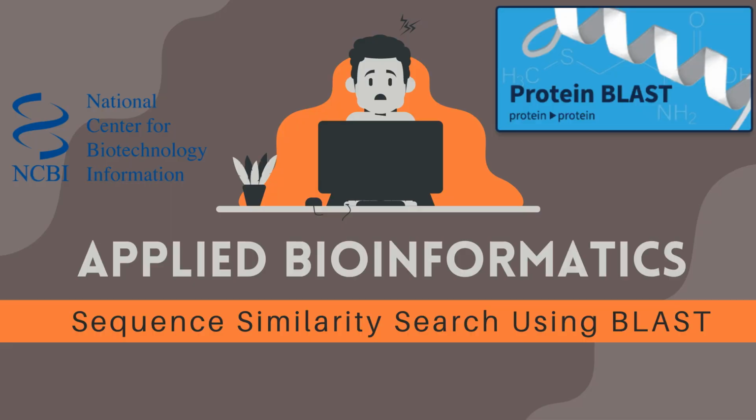Hello and welcome to this tutorial on sequence similarity search using BLAST. In this video, we will explore how to use the BLAST tool to search for similar protein sequences, understand sequence alignments and interpret BLAST results. We will also explore how changing the database and scoring matrices affects the results.